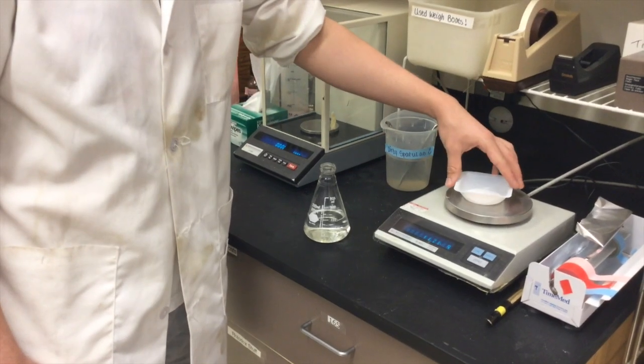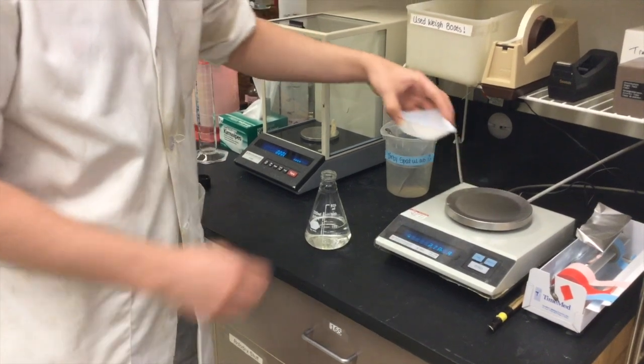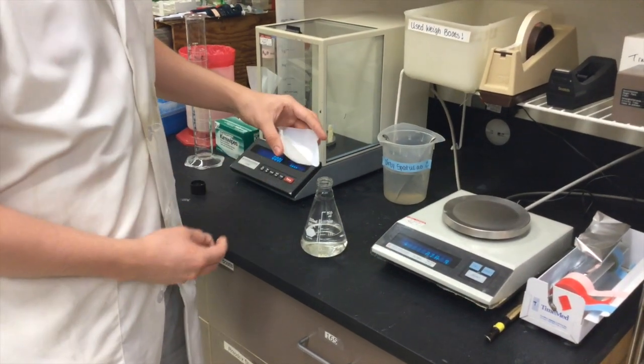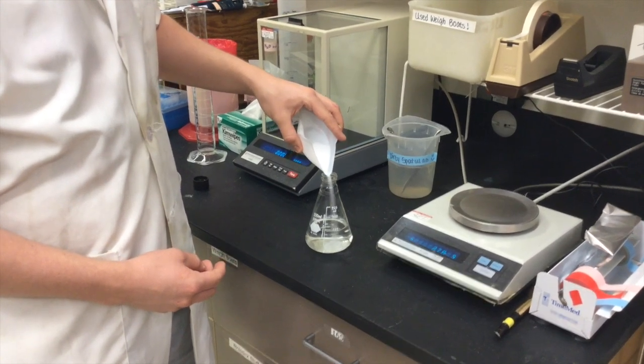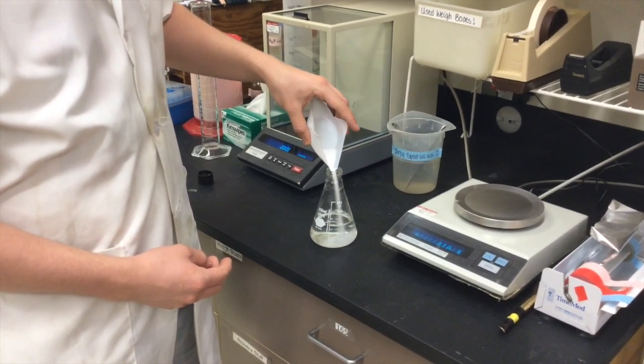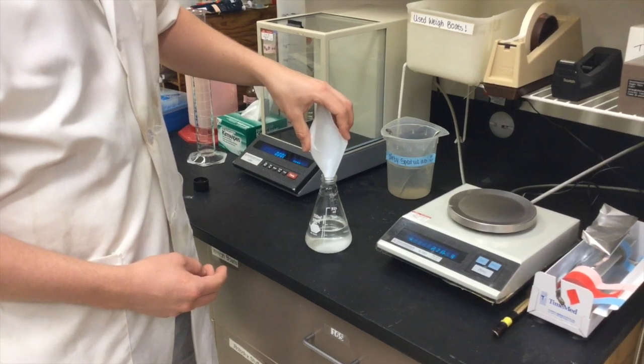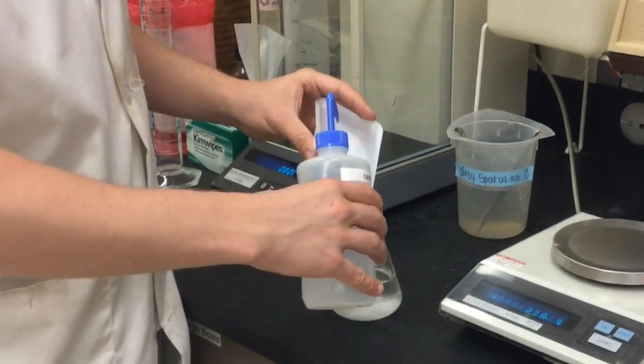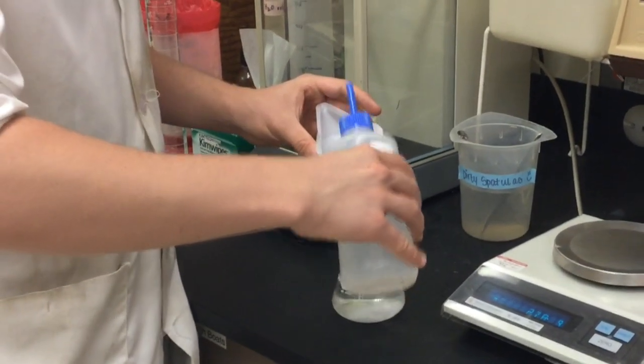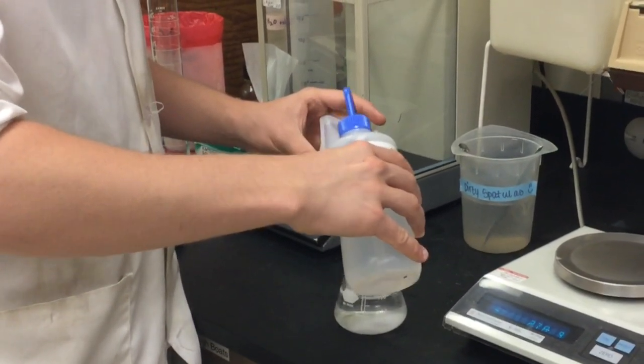Carefully pour the 11.69 grams of sodium chloride into the flask. Because this weigh boat is flexible, we are able to bend it and make it a funnel instead of having to use an actual funnel. Use the squirt bottle filled with nano-pure water to rinse the remaining sodium chloride crystals out of the boat and into the flask.